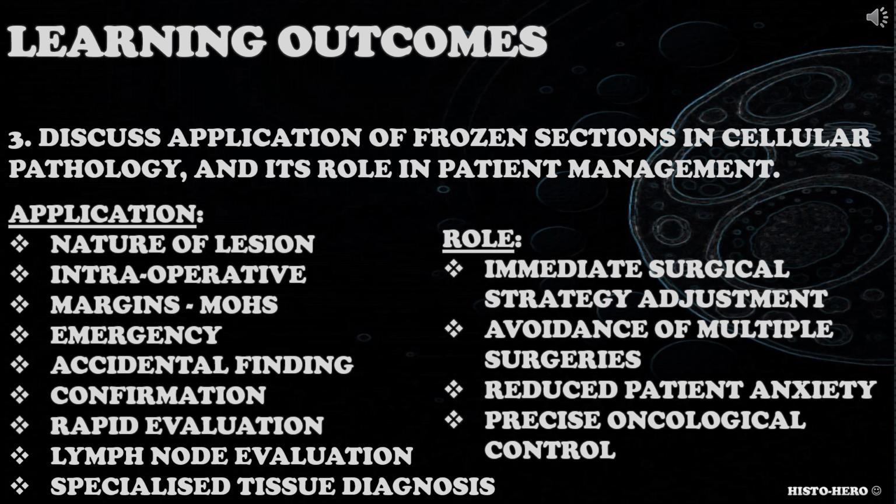What are the limitations of frozen sections? Consider artifacts, turnaround time, high-risk samples, diagnostic accuracy. What role do frozen sections play in patient management? Consider rapid diagnostic information during operation, surgical margins, metastasis identification, guiding the extent of surgery.